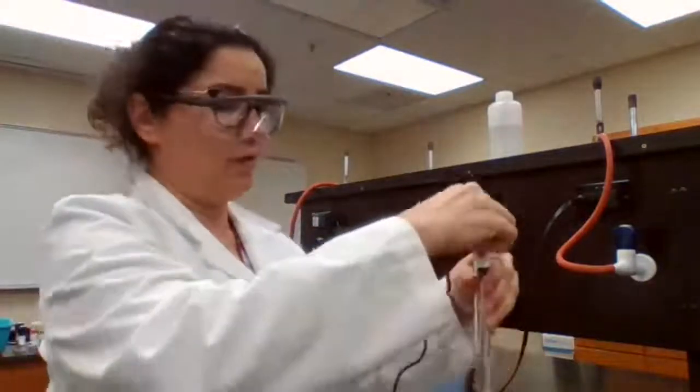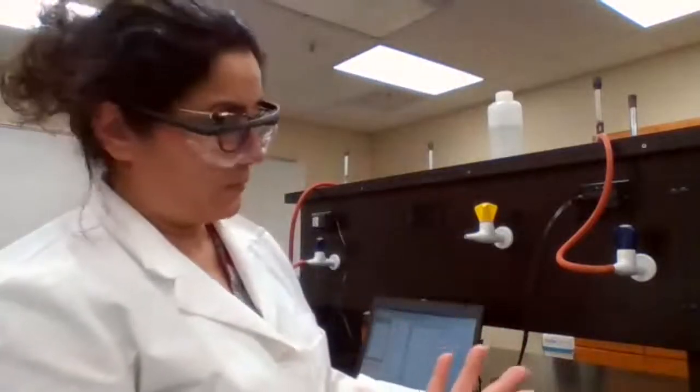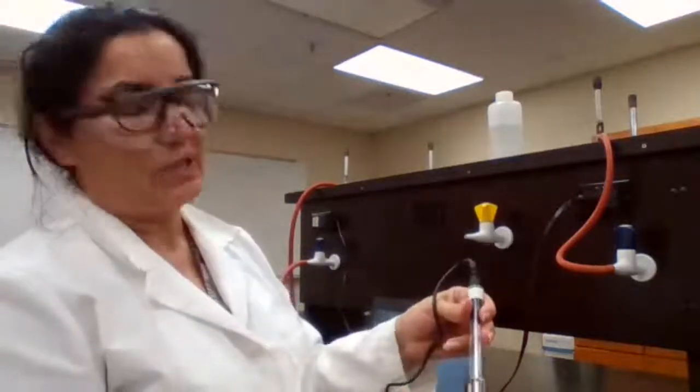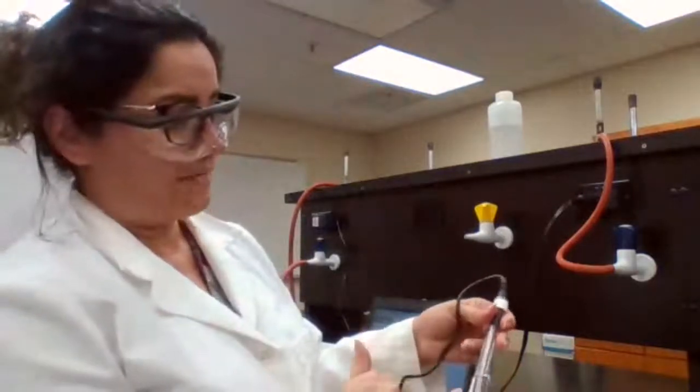The procedure that you wrote for me is to heat it up to 90 degrees to make sure everything dissolves at a high temperature. So the only thing that we are looking for is at what temperature you will get crystals back. Because the temperature of the water is very high, it could dissolve, and when it still is dissolved, right? 29 and is dissolved. So it could dissolve at 29 or any temperature higher, but I don't have the lowest temperature yet.